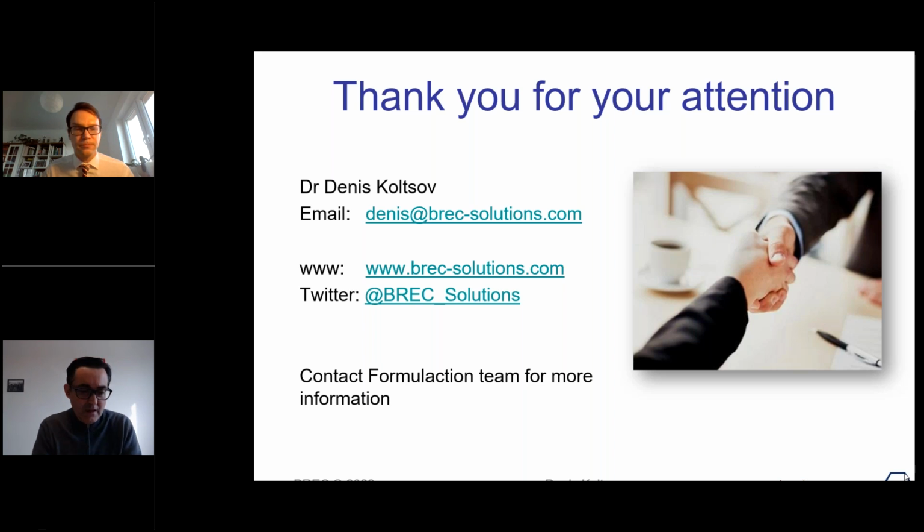Okay, thank you, Denis. And as we said, all the measurement is driven also by the refractive index, and the higher the refractive index difference between the continuous phase and the dispersed phase, the bigger is this difference. Pascal, it's very faint. Can you speak louder? Oh, sorry. I was saying that the more the difference of refractive index between the continuous phase, the liquid, and the dispersed phase, for instance the particles, the more sensitive is the SMLS, because we scatter a lot of light, so the backscattering measurement will be very high and very sensitive. So yes, definitely, as you showed in your slide, titanium dioxide, for instance, which has a high refractive index of 2.5, depending on the material, works very well.